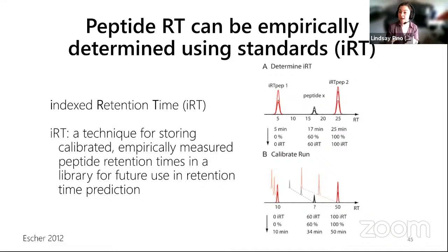So that's really all IRT is doing. You can set these red anchor peptides to be anything you want, as long as you measure them in both runs in all of your mass spectrometry acquisitions. As long as those anchor peptides are there, you set up the calculator one time, and then after that, you can apply that calculator in any other samples.